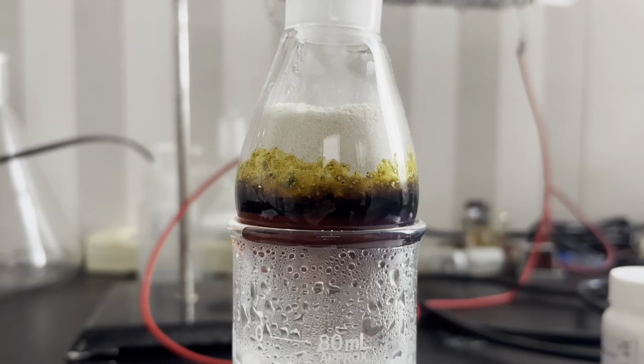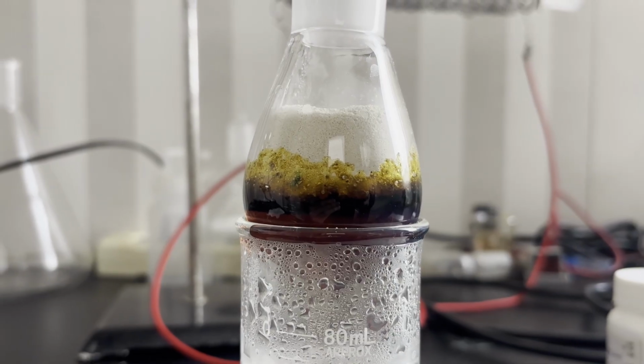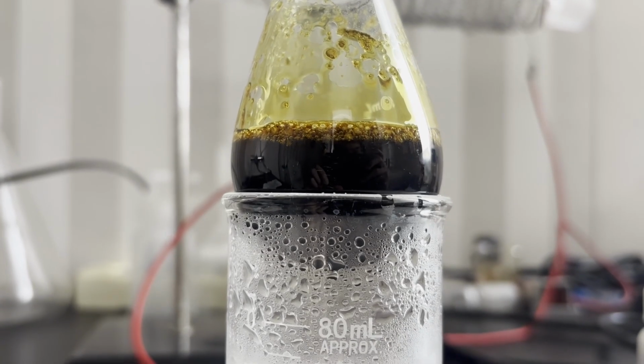The flask is stoppered to prevent moisture from entering, and placed on a beaker of boiling water for 1 hour. Initially, the heavier sulfuric acid sinks to the bottom of the lighter N-phenylanthranilic acid, but after I swirled the mixture, they seem to mix evenly to a brownish yellow liquid.